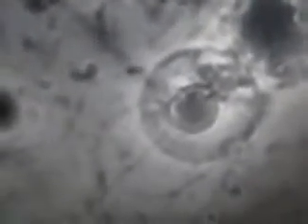You can see the size of the red blood cell here and how big and wonderful it is. Looking at that thing, and then on over we have a PMN that's dead. This is one of the kinds of cells that we see with bacteria entrapped inside of them, and you can see the tremendous number of large spirochetes around it. There's a very long one here, probably a good 15, 16 micron long spirochete. And you can see the tremendous activity these guys have. Just an amazing, amazing thing. Right next to that PMN, there's a huge long spirochete here. And then you see other types.